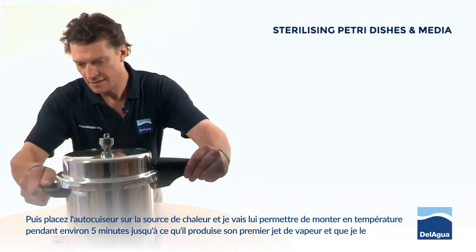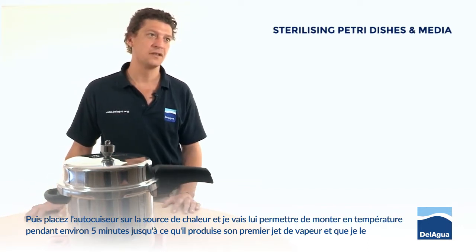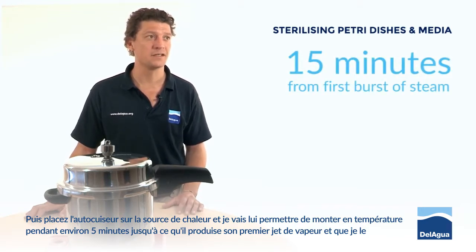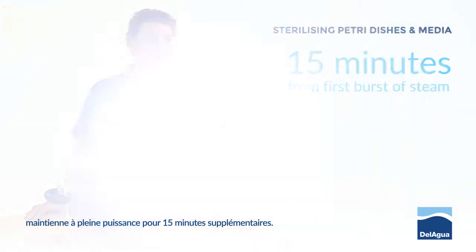I then place the pressure cooker onto the heat source. I'm going to allow it to come up to temperature for about 5 minutes or so until it gives its first burst of steam, and then I'm going to keep it on full power for another 15 minutes.